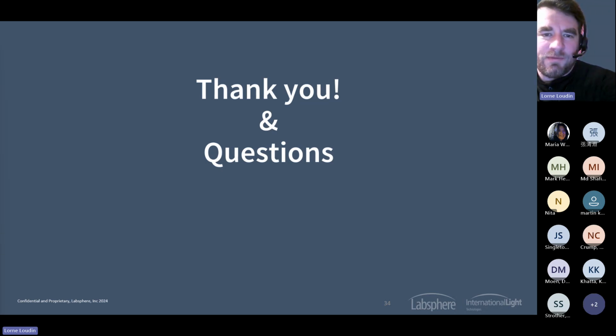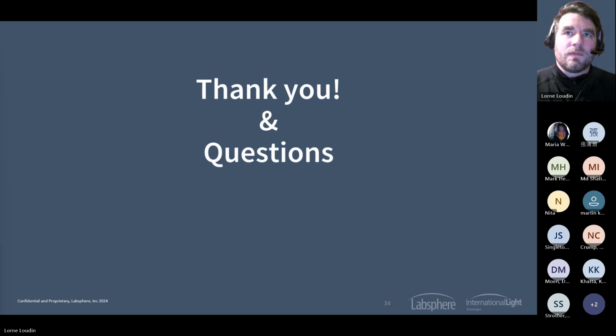I don't think Labsphere is really working with 1,000. You're using a FEL lamp then, right? So it's a directional lamp. Is that correct? No, I use it horizontally as if it was used in a work light. It has an electrode at either end, not two electrodes at one end. Okay. I was going to say Labsphere did have the FEL for a while, but that was more of a directional 2 pi style source. But it's one thing we can check about. We didn't pick up any of the Gooch and Housego replacement products. Unfortunately, we just didn't pursue that direction.